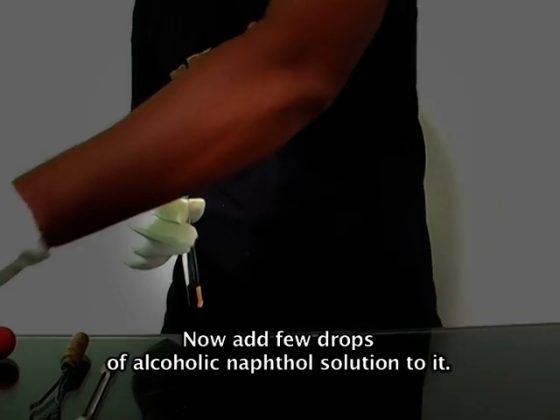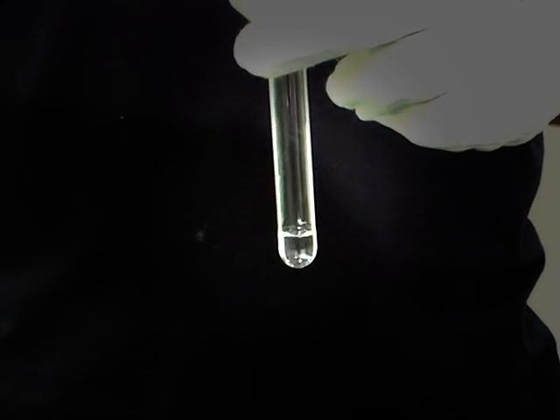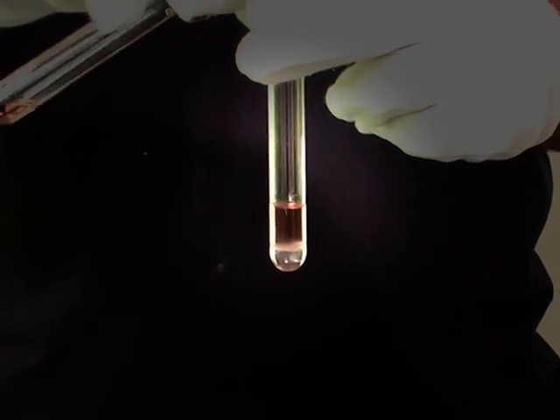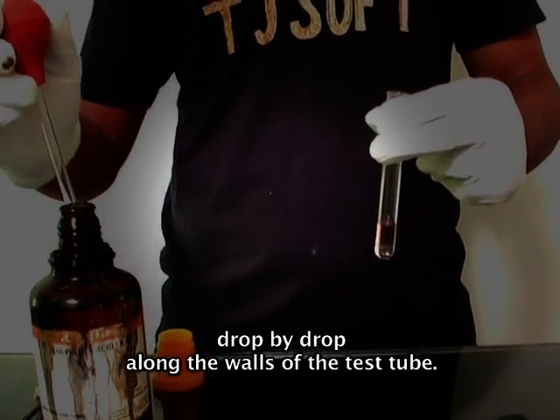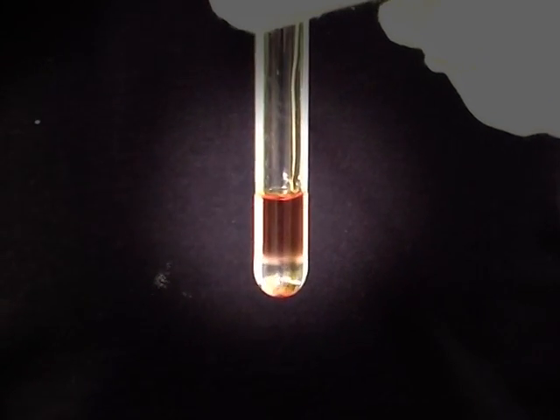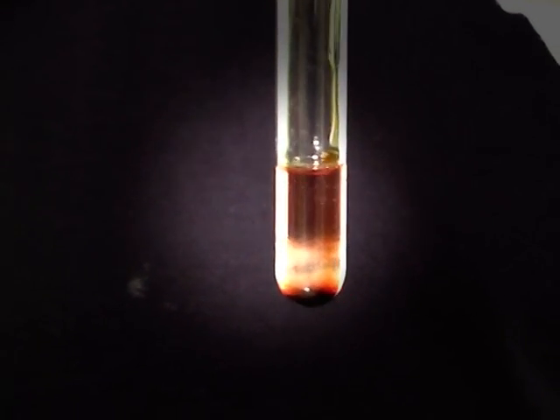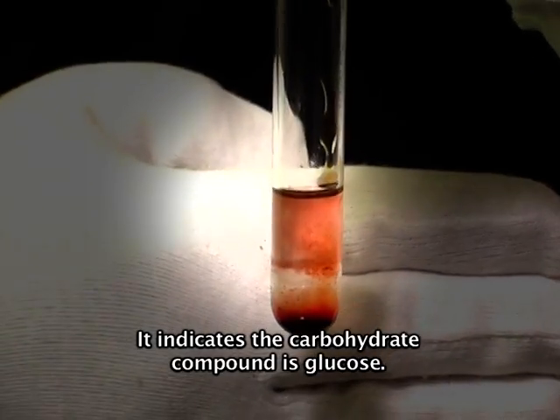Now add a few drops of alcoholic naphthol solution to it. Now using a filler, add concentrated H₂SO₄ drop by drop along the walls of the test tube. Observe here: a deep violet-red color solution is forming. This indicates the carbohydrate compound is glucose.